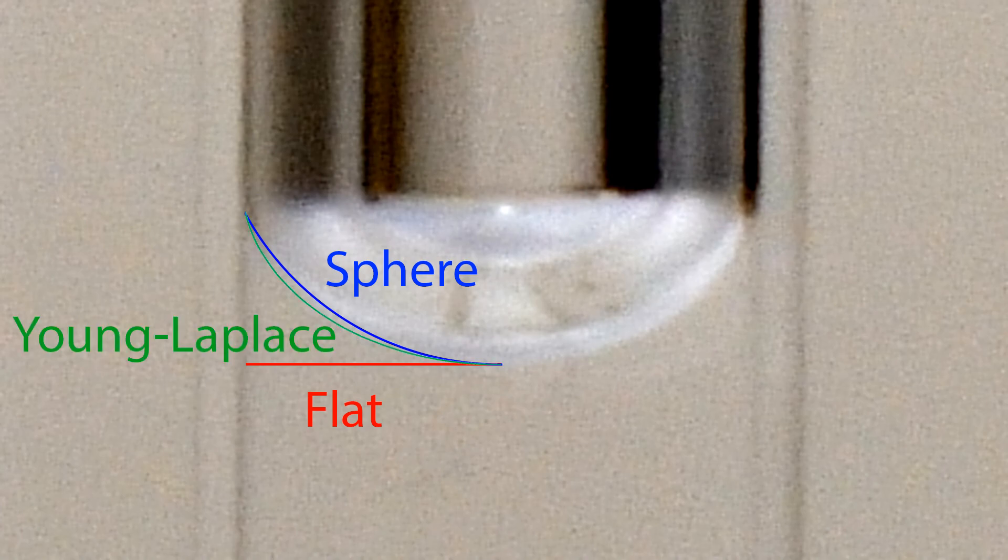The shape of the meniscus at the top of the sample affects the shape factor significantly. A horizontal line model is not sufficient. A spherical cap fits the meniscus better. However, for a good fit, we need to use the Young-Laplace model shown here for chloroform.